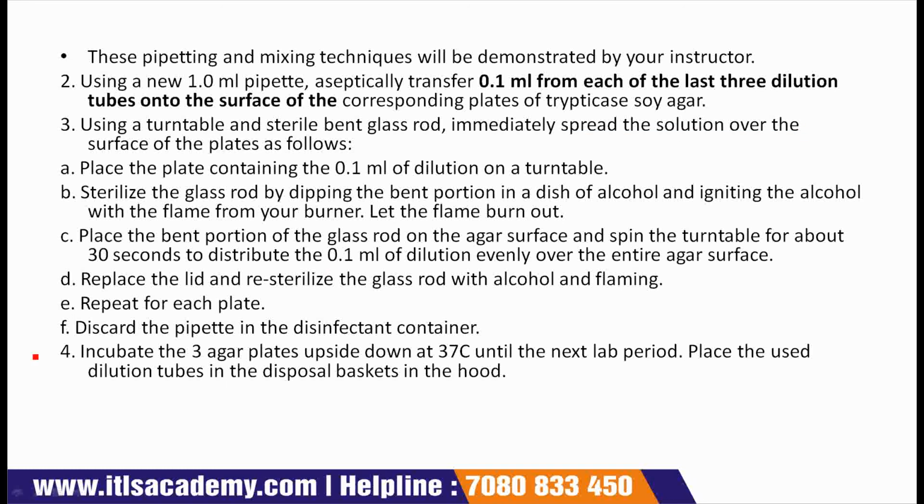Our fourth point is incubate the 3 agar plates upside down at 37 degrees centigrade until the next lab period. Place the used dilution tubes in the disposal basket in the hood.